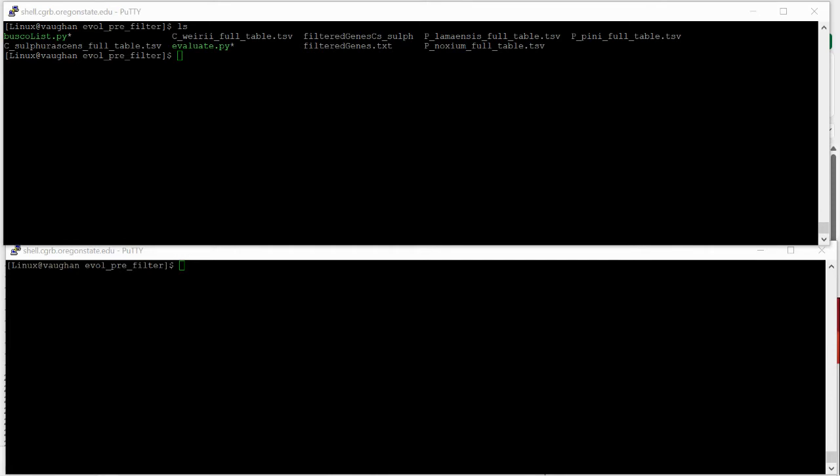A small disclaimer: I did change some of the naming of the files and some of the directories since I worked on this last, so that's just something to keep in mind. It might be inconsistent from steps 1 and 2, but the general concepts are the same. I'll try to keep it more consistent moving on, but just wanted to let everyone know.